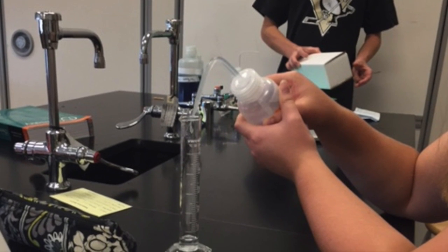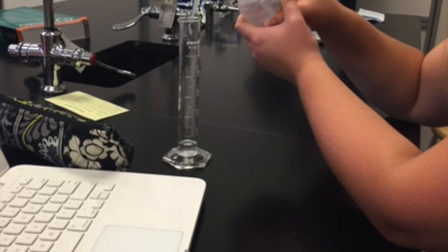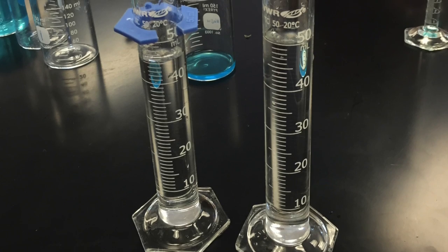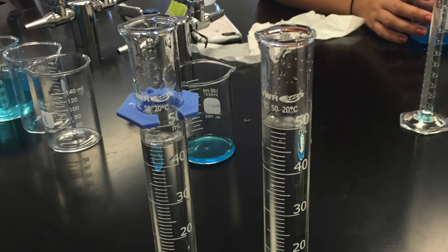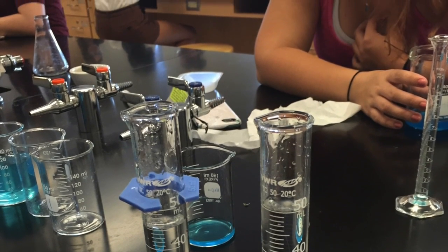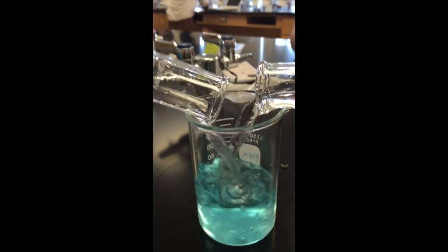Now you can see, measuring out the deionized water that will be needed to add to the small amount of stock solution that will be diluted out using the water. The water was then added to the stock solution in the graduated cylinder, which then created the dilute solution.